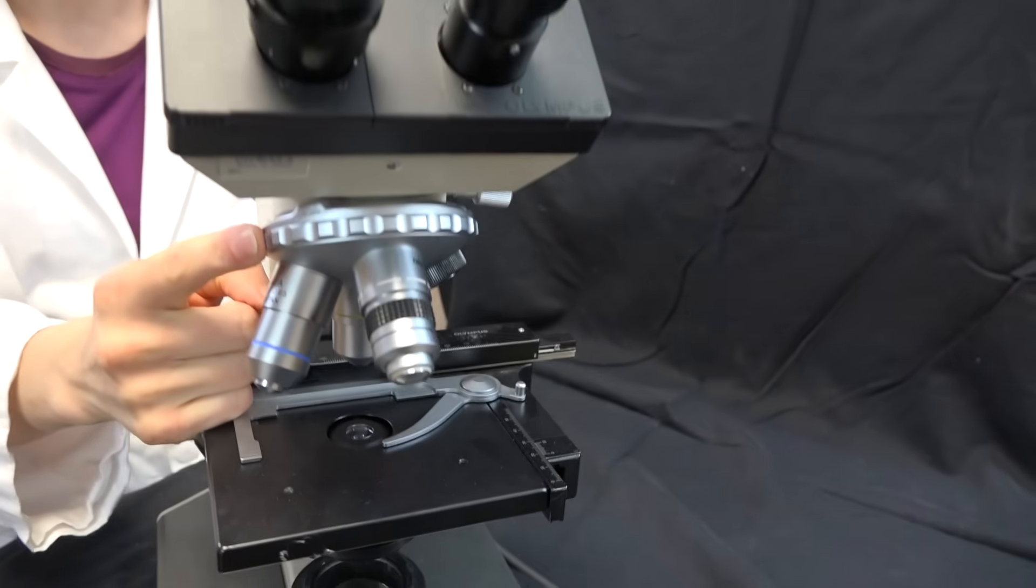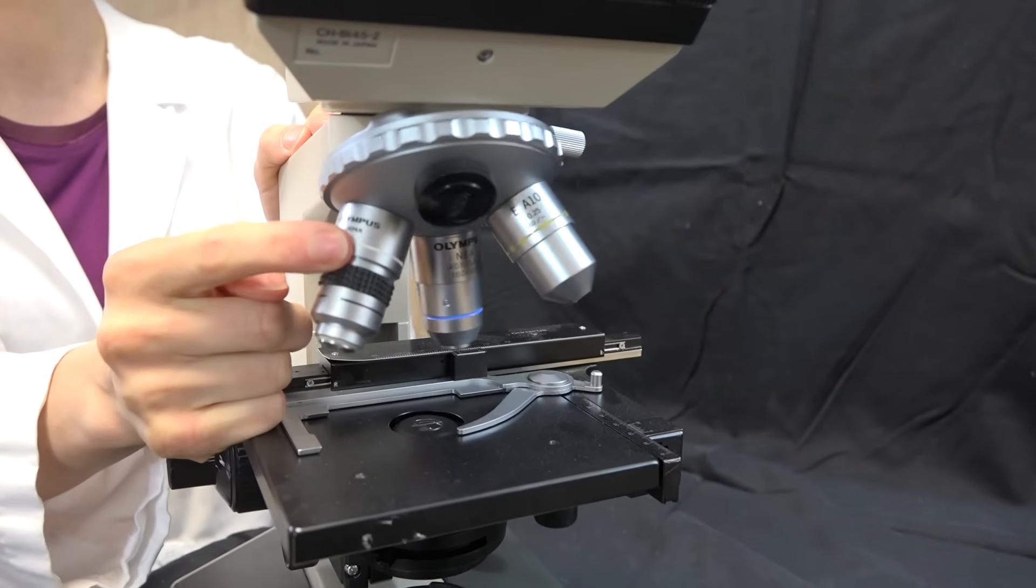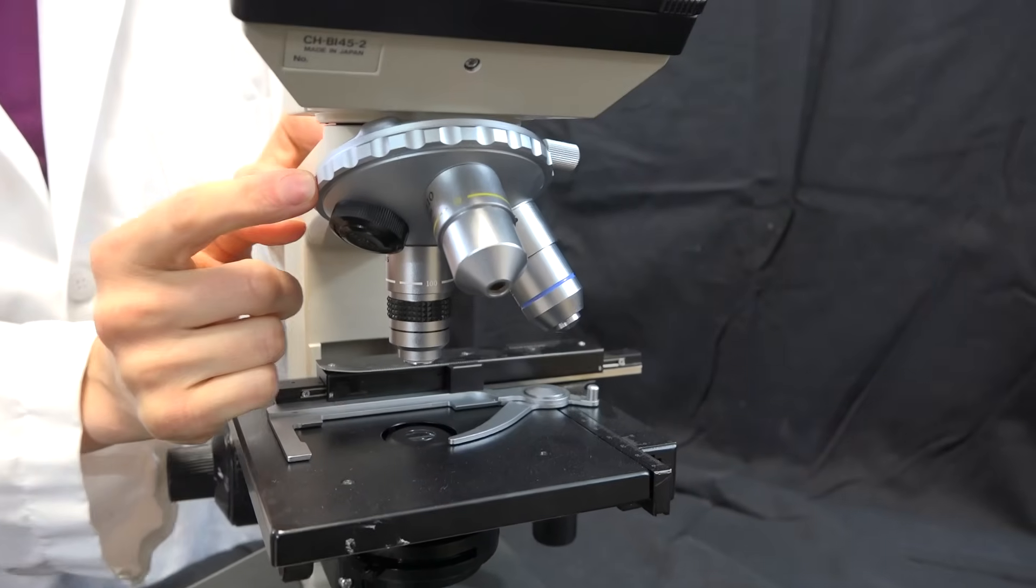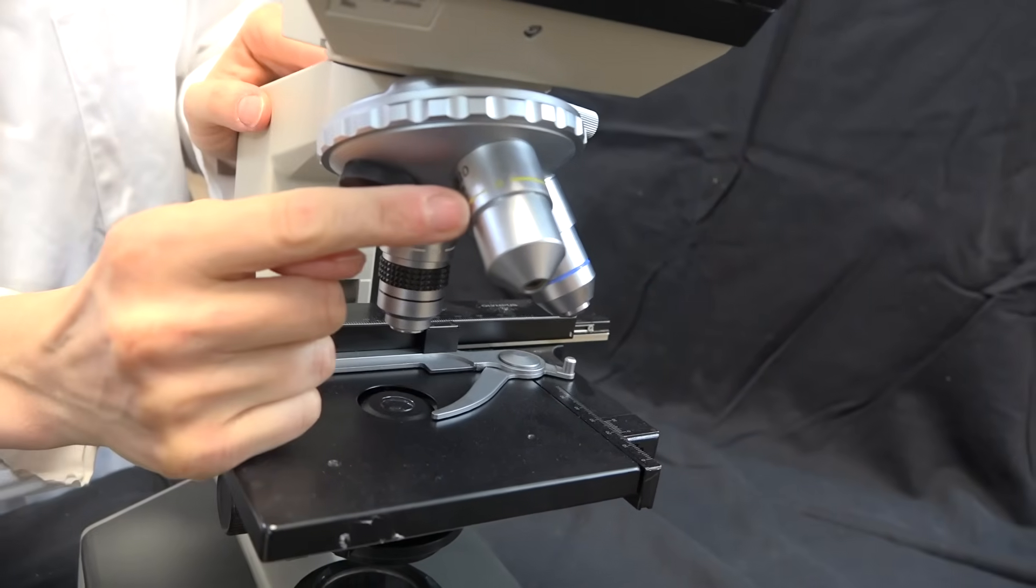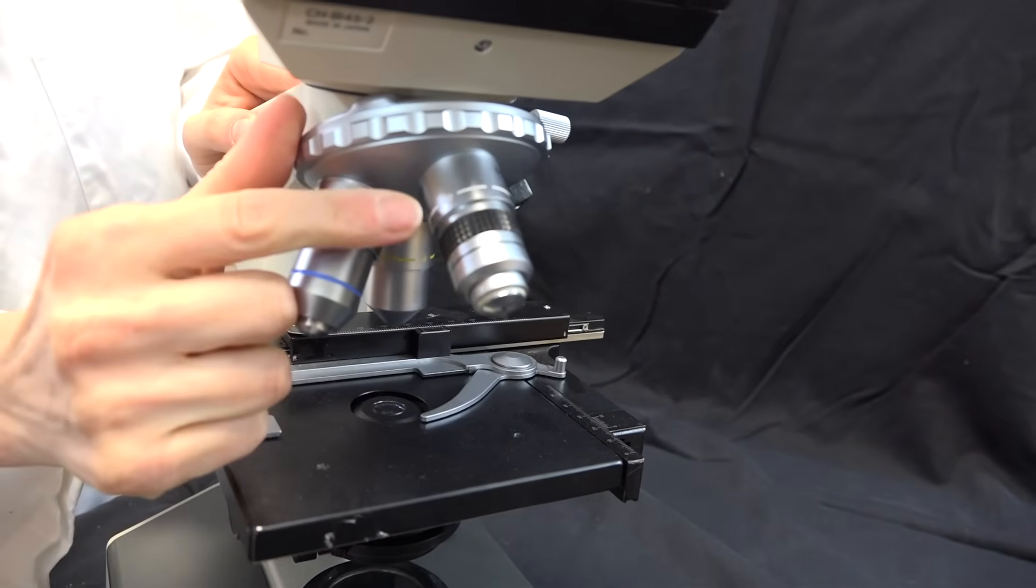Down here is the revolving nose piece. Each of the lenses you see on the revolving nose piece has a different magnification. This microscope is outfitted with three objectives: a 10x, a 40x, and a 100x.